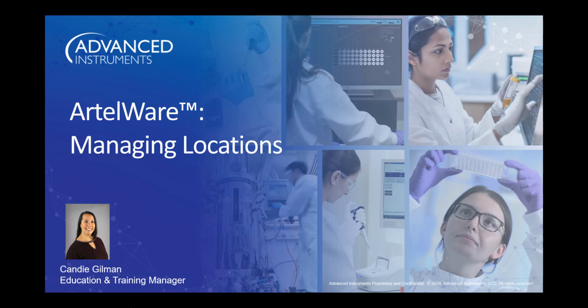Thank you for joining me for this brief tutorial that walks through managing locations in the ArtelWare software application. I have a lot of information to share with you, so let's go ahead and get started.